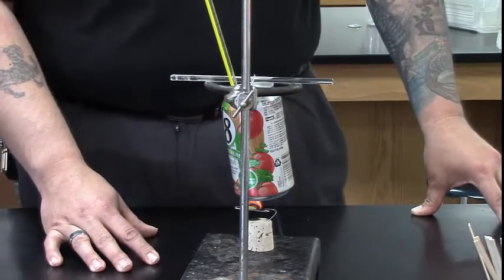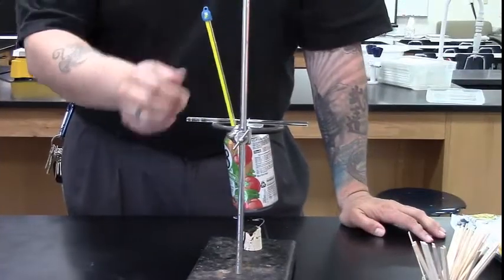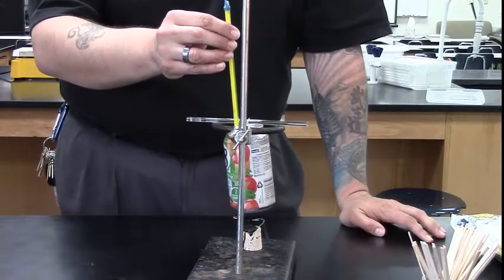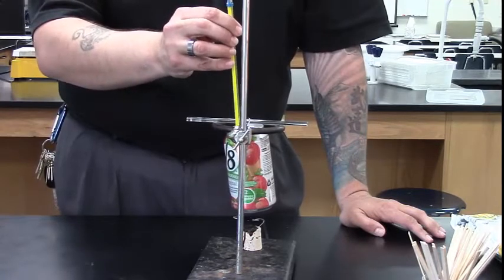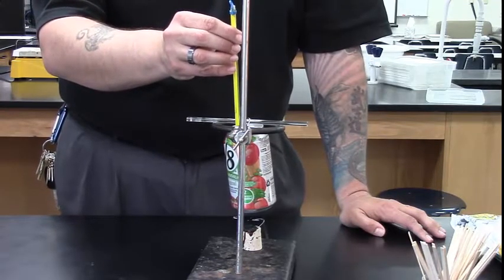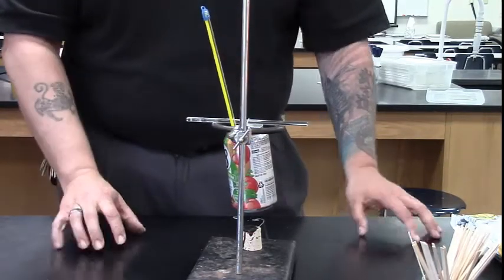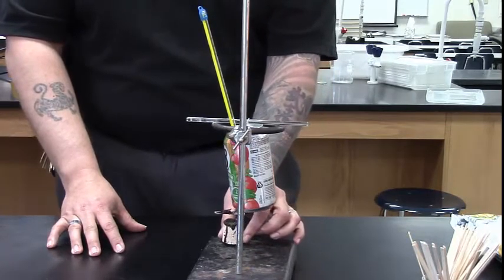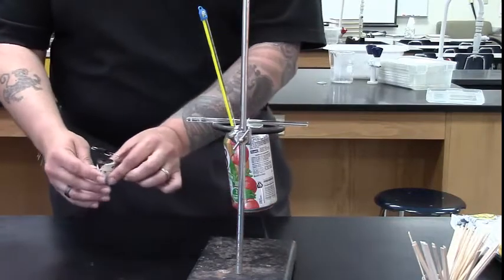We'll let the Frito burn until it burns itself out — shouldn't take very long. Once the Frito has burned itself out, we need to measure the temperature of the water at its highest point. We can stir it a little with the thermometer and read the temperature when it reaches its highest point — that will be our final temperature. The last thing we need to do is take the residue that's left over and weigh it again.